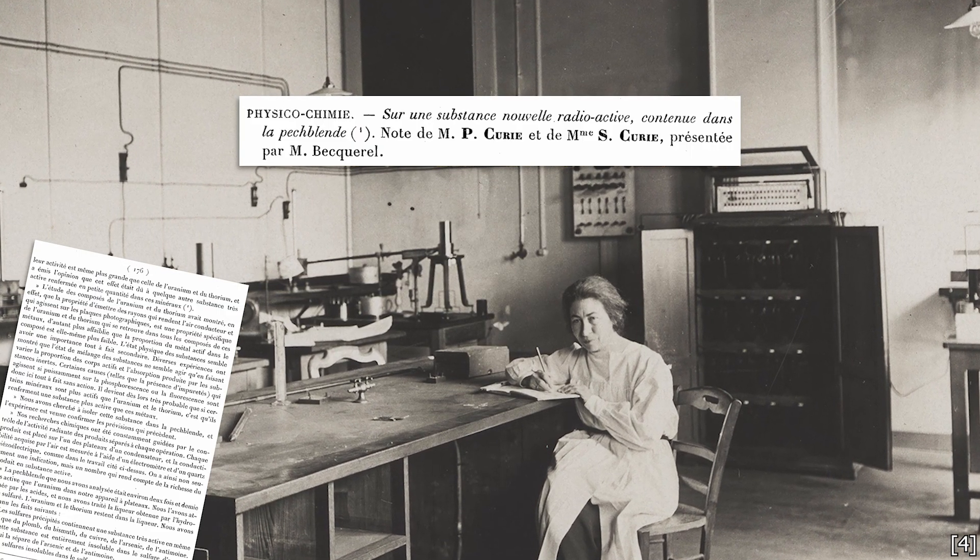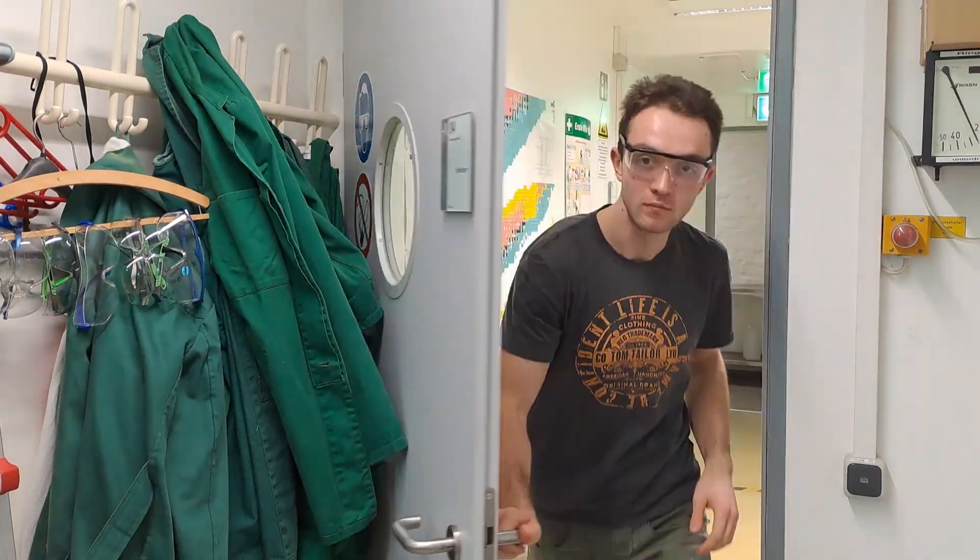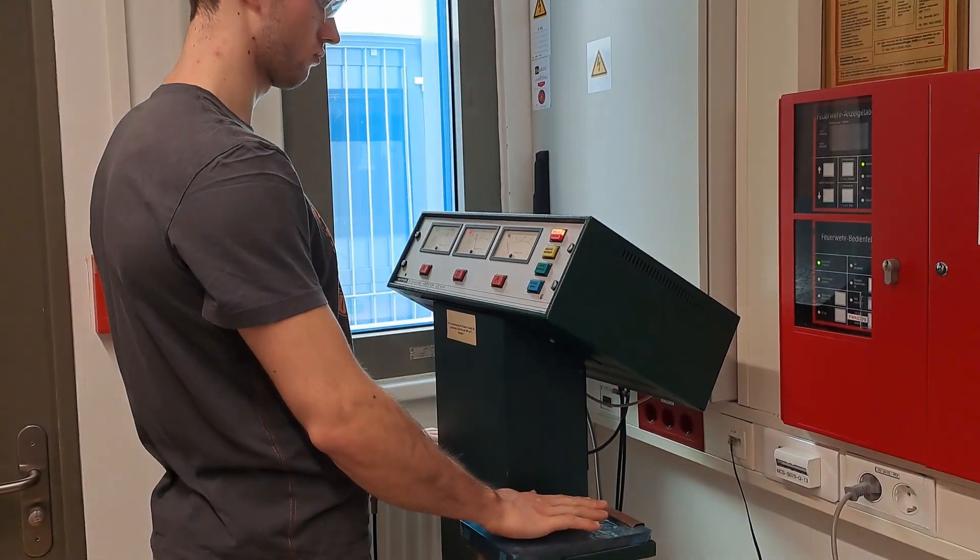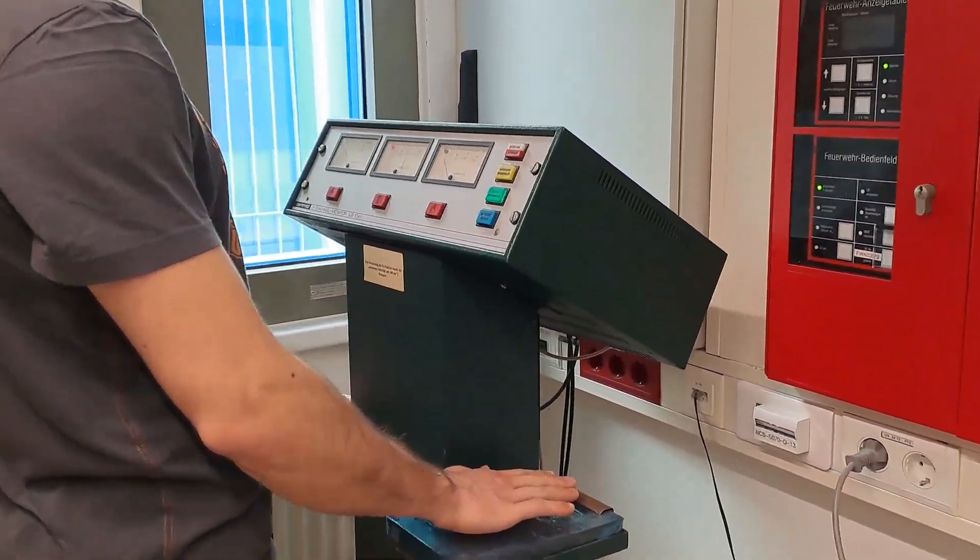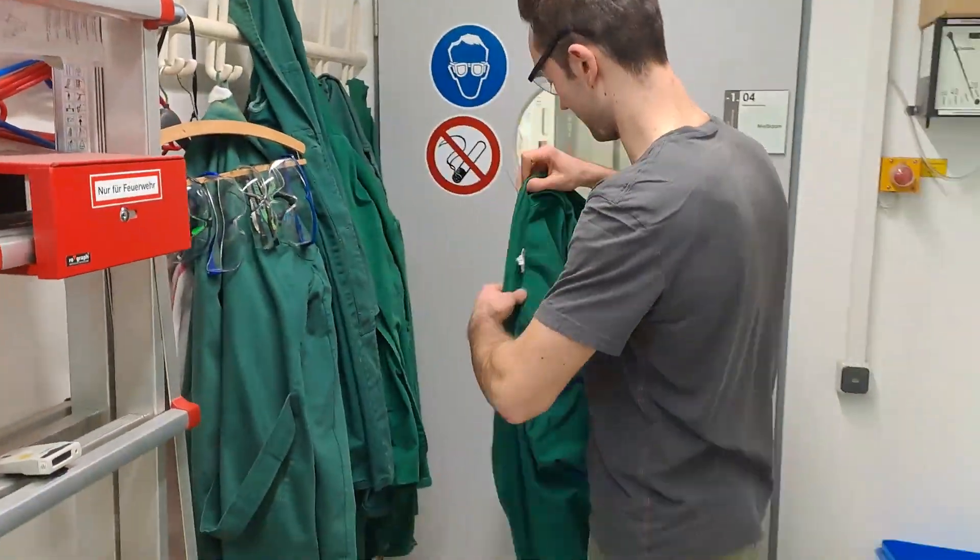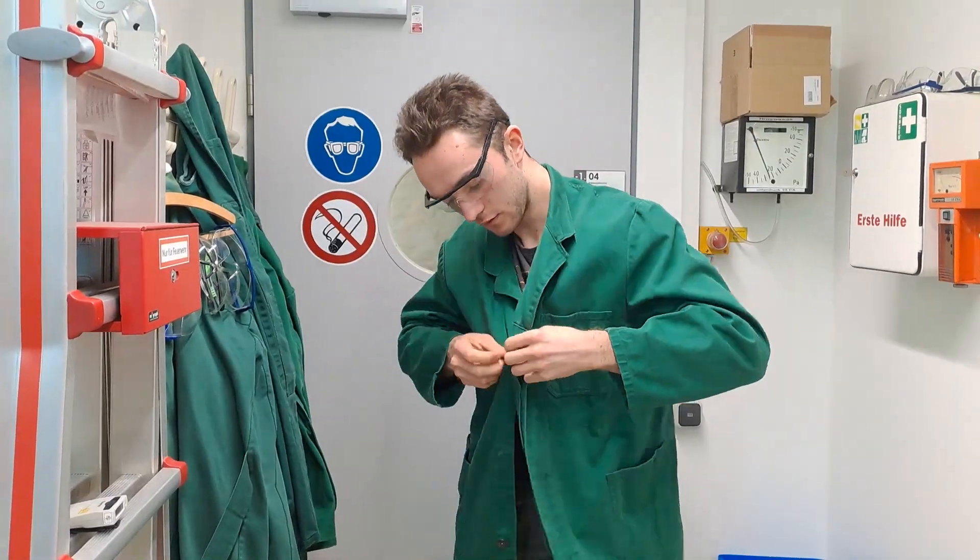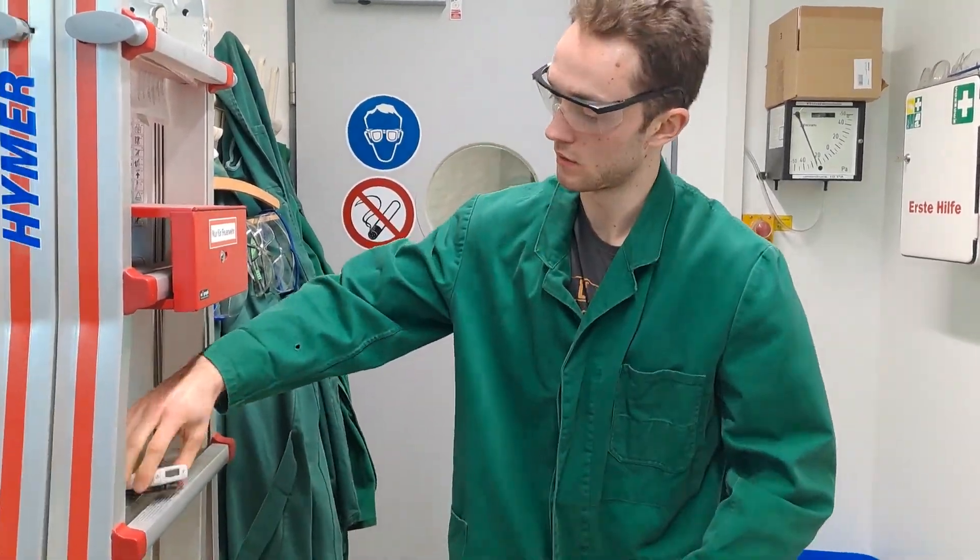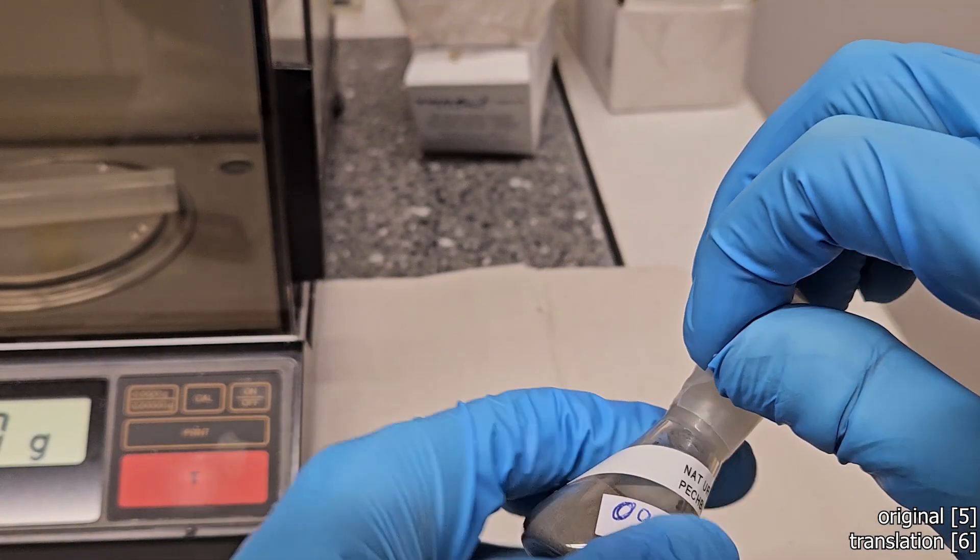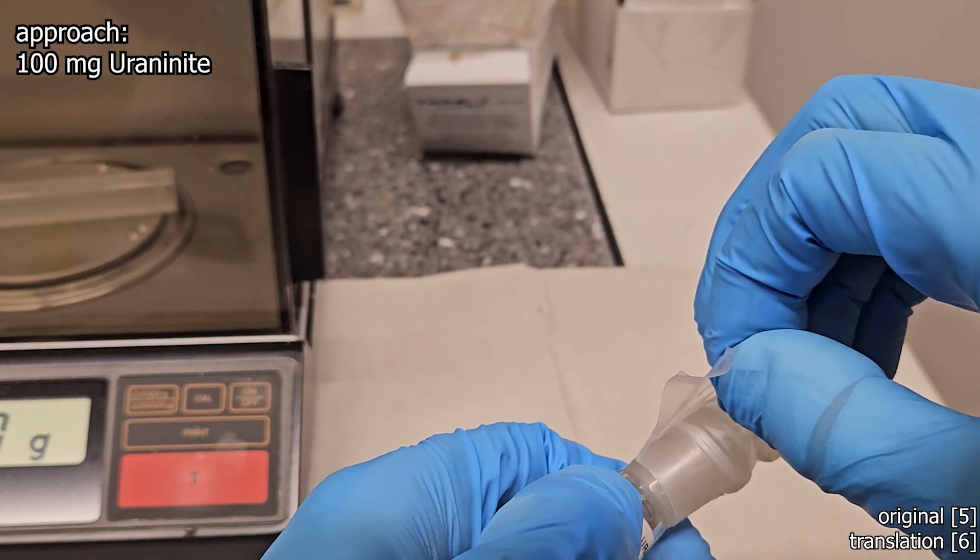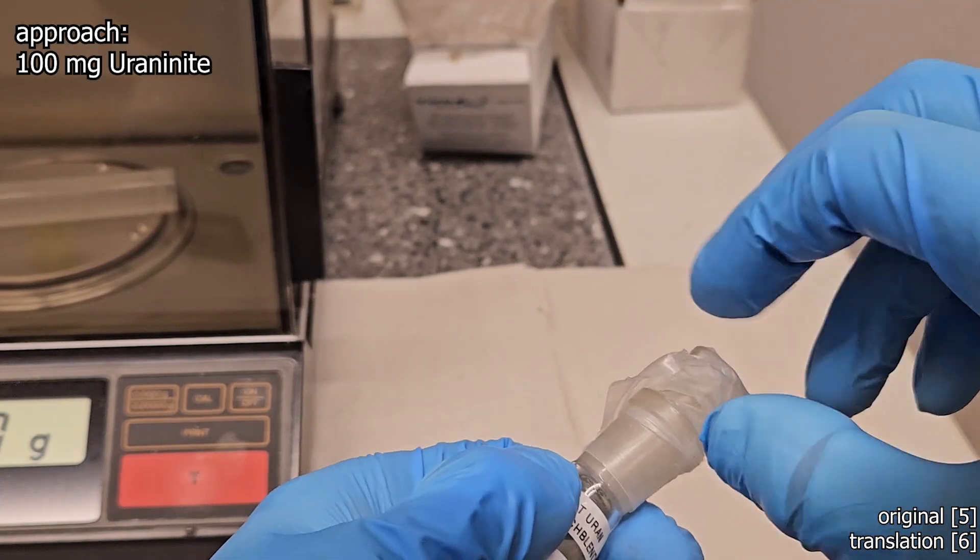One of them is polonium, and today we are going to recreate the method she used back then to isolate this element from pitchblende. For radiation safety reasons, I cannot directly replicate her experiment. The good lady took 100 grams of pitchblende and then later realized she would need a few tons. We are doing this on a milligram scale.